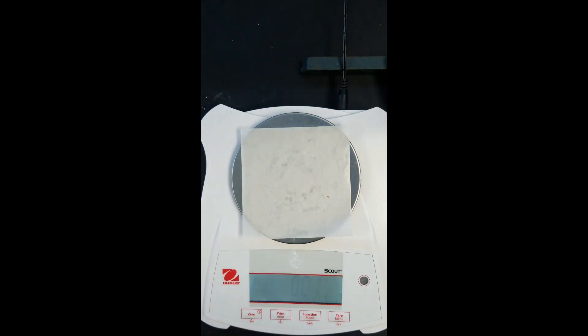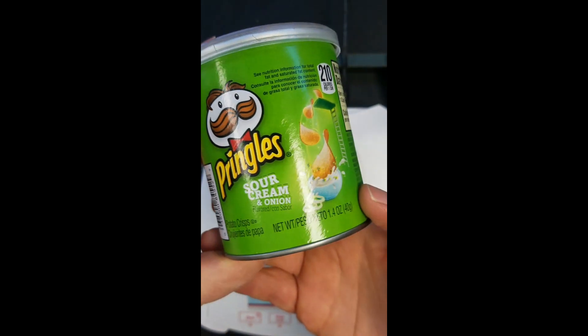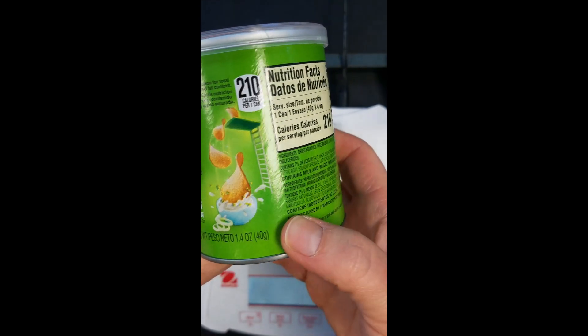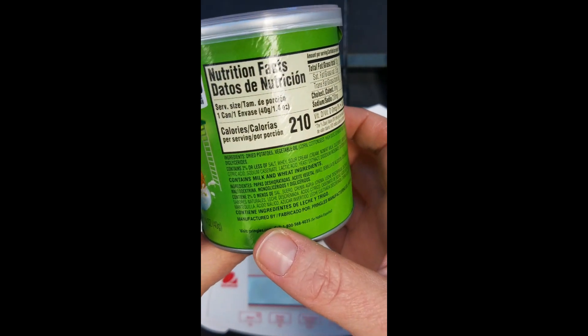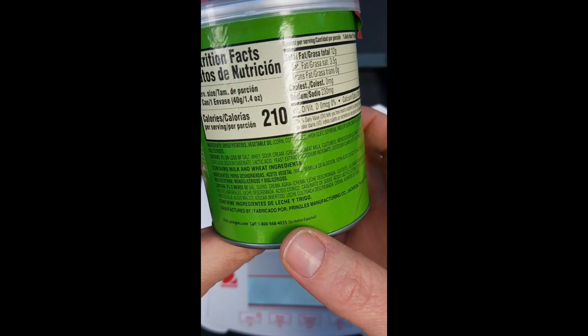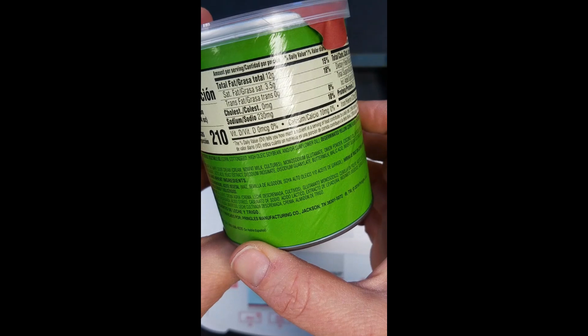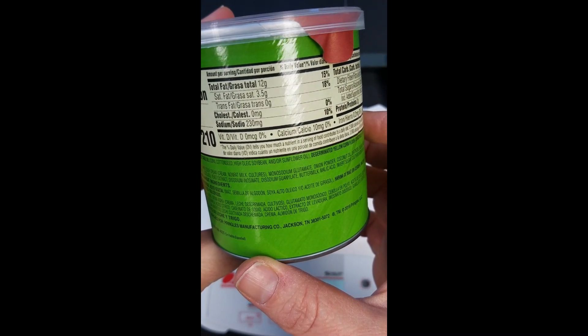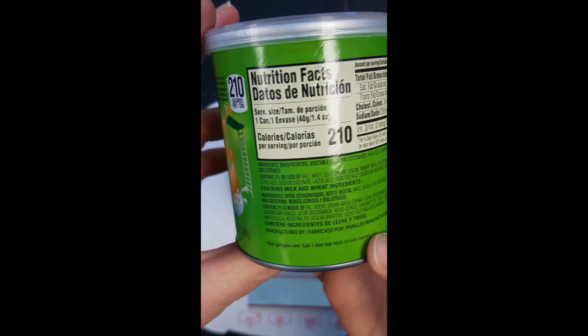We're going to start our second trial, we're going to weigh an empty 100 milliliter beaker so that we can do our second trial using Pringles. And so our serving size is 40 grams. We have our calories from fat and our percentage of fat for our Pringles.